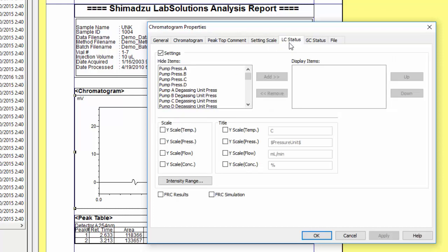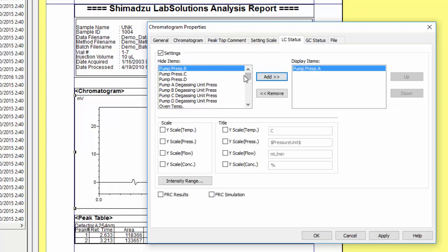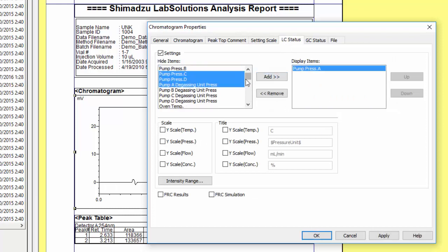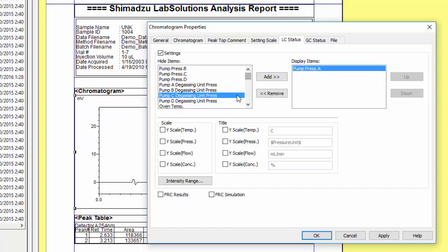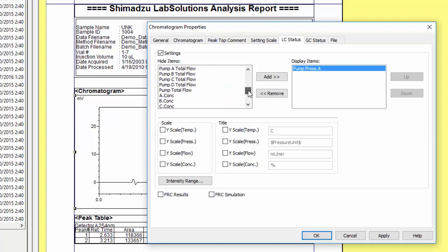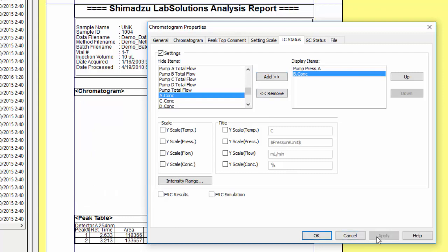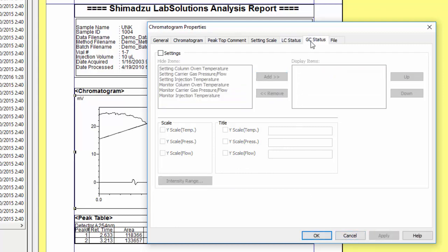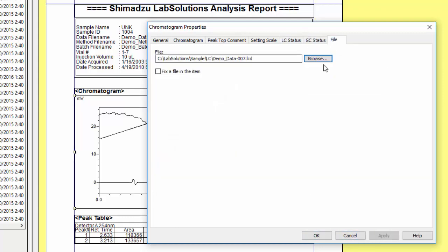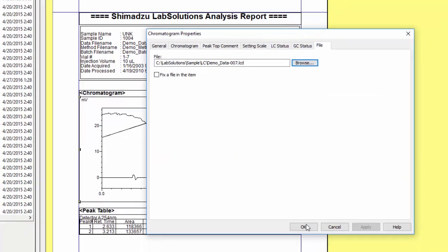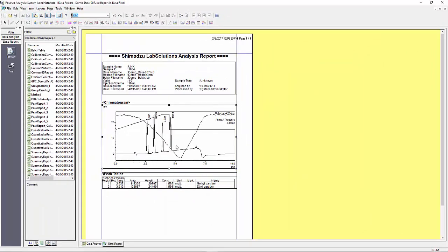One of the more underutilized features within LabSolutions is the ability to visualize traces. Under the LC status tab you will see a list of trace items such as pump pressure, temperature, flow, and concentration. When you add any of these items to the displayed column they will overlay with your chromatogram to show the time correlation. You can then independently scale each trace. As you can see in this example, it is very valuable information to overlay your gradient concentration, pump pressure, and chromatogram to see the time correlation between them.